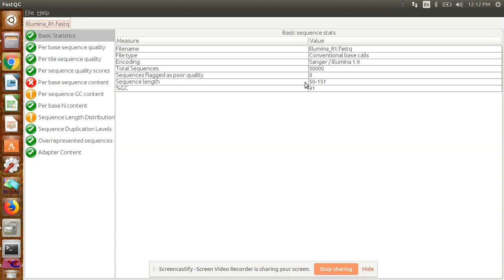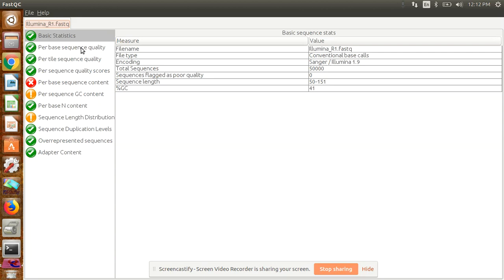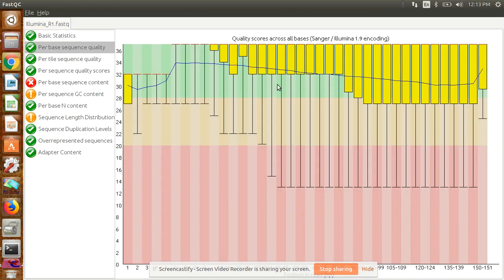We can see our sequence length here. The basic thing we need to see is the left side—it will show different parameters based on which we can check if our quality is good or not. First, come to per-sequence quality. For that, open it. Here it will give you a Phred score.